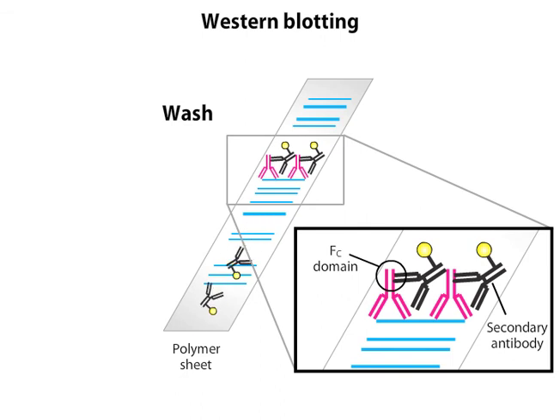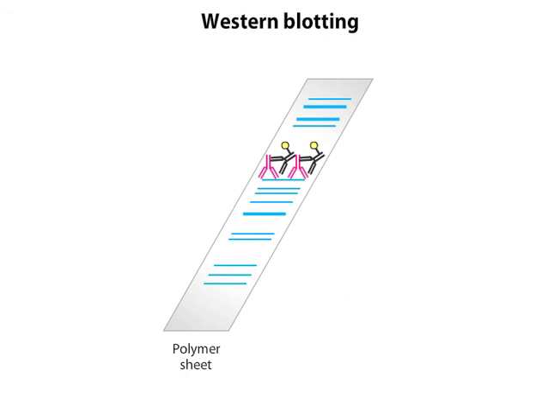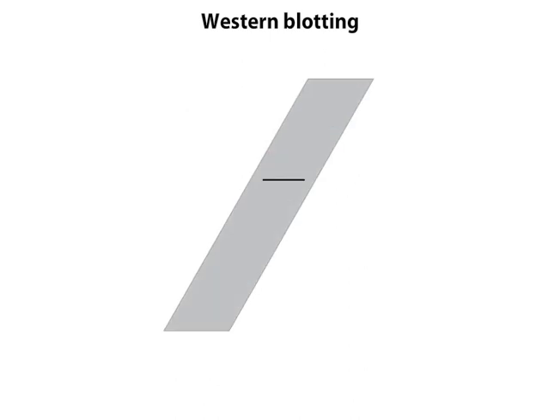Typically, the secondary antibody is linked to an enzyme that produces a chemiluminescent or colored product, or it contains a fluorescent tag, enabling identification and quantitation of the protein of interest. Illumination with the appropriate wavelength makes the tag fluoresce. The emitted fluorescence can be detected by specialized detectors. Western blotting makes it possible to find a protein in a complex mixture, the proverbial needle in a haystack.